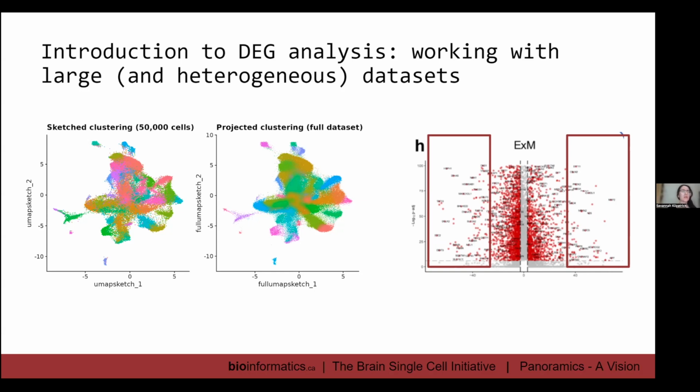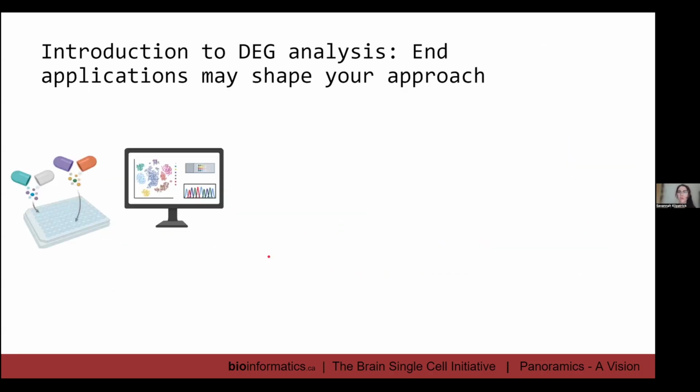Okay, so these are just some considerations for your DG list, or the way that you approach your differential gene expression analysis. Another consideration is, what's your end goal?